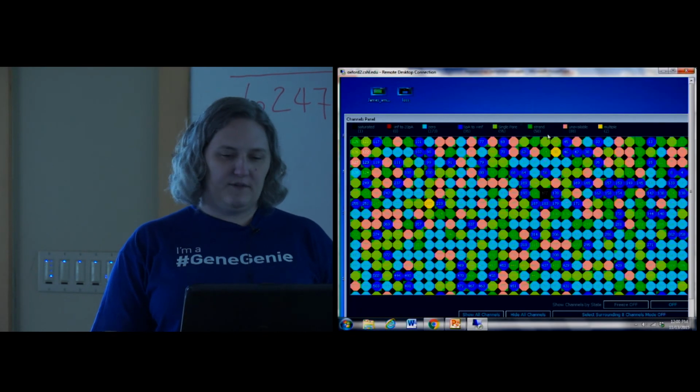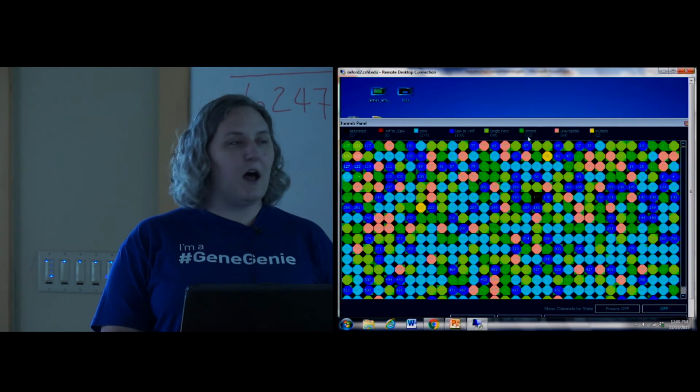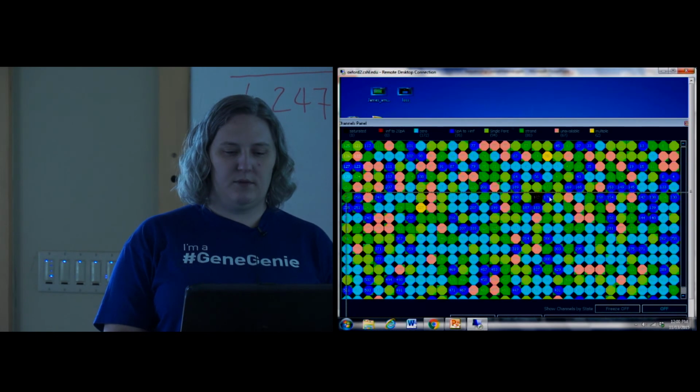I'm going to do one thing here. We'll just pop back over to our sequencer so you can see what's going on. Look, we have 60, 70, 50. It was at 70 a second ago in strand. This is going to be changing a lot because there are short reads. Let's see what we've got.